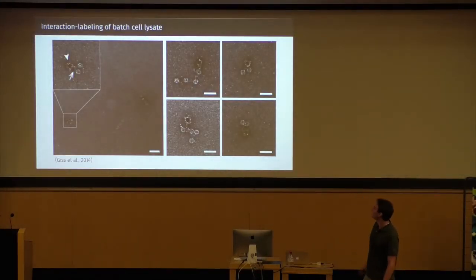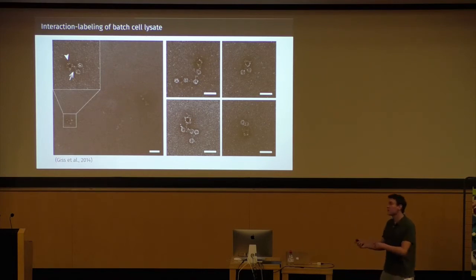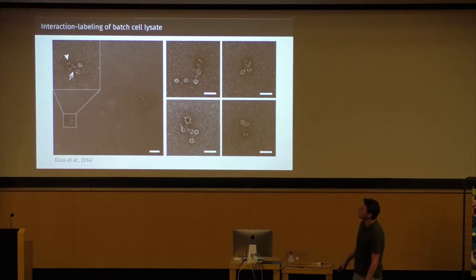So what was done here was, in the first fishing step, apoferritin was fished out of cell lysate. Then in the second fishing step, this apoferritin was used as a bait for ferritin antibodies. And in a third step, these ferritin antibodies were labeled with immunogold. Then the magnetic nanoparticle was cleaved off, and then the remaining stuff was written to a grid.